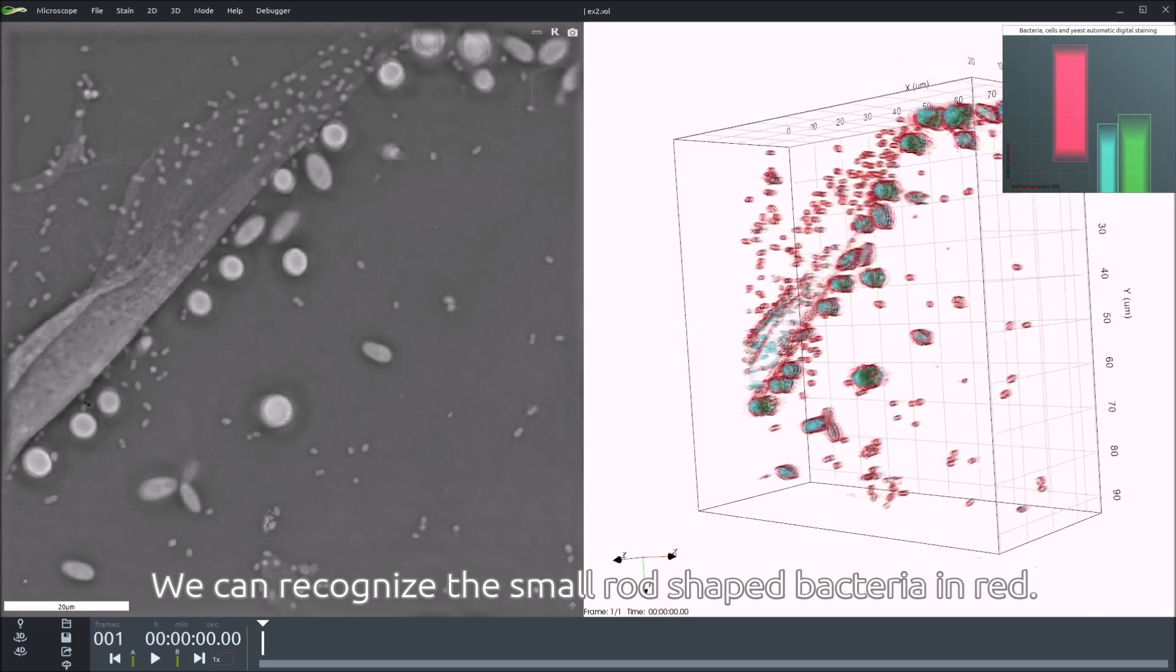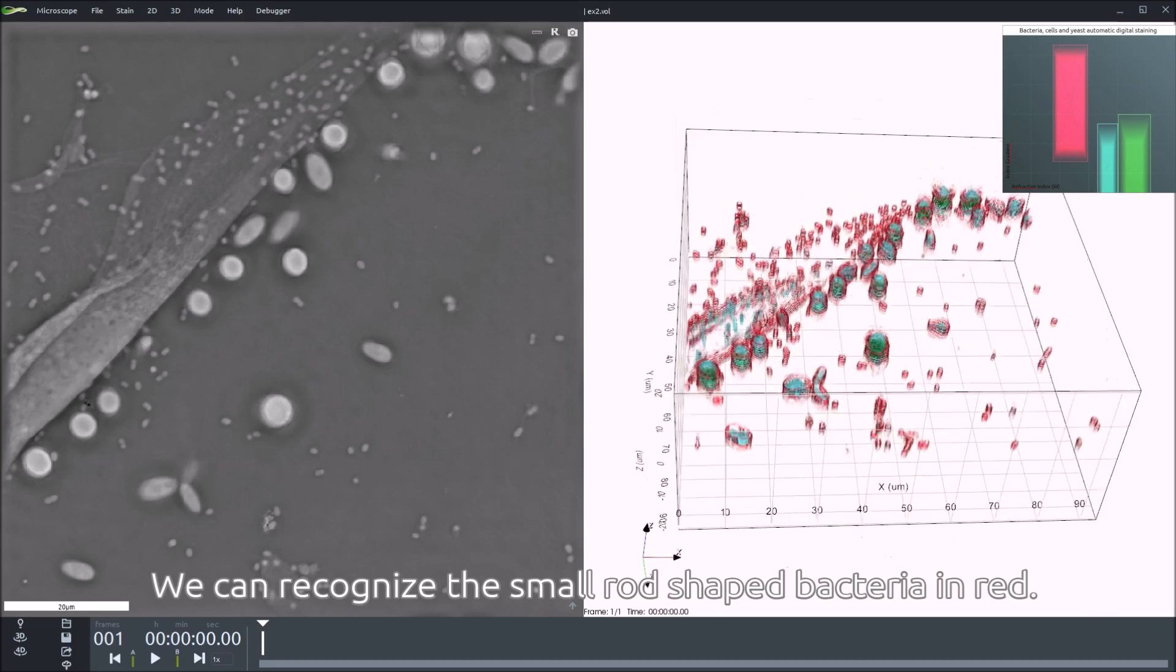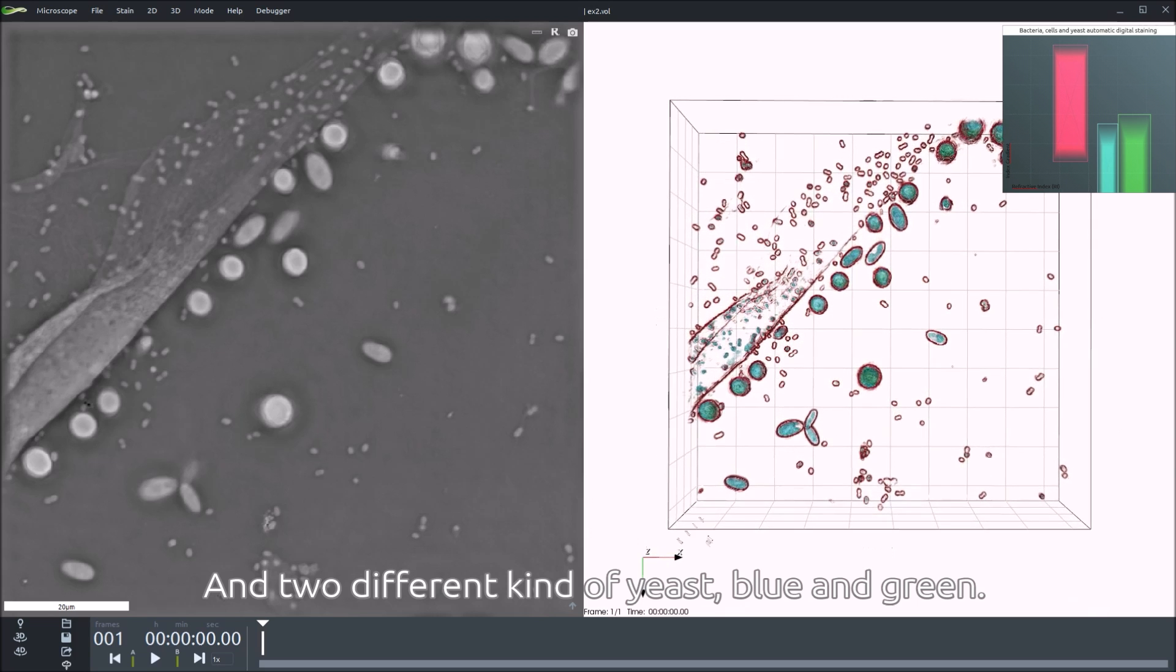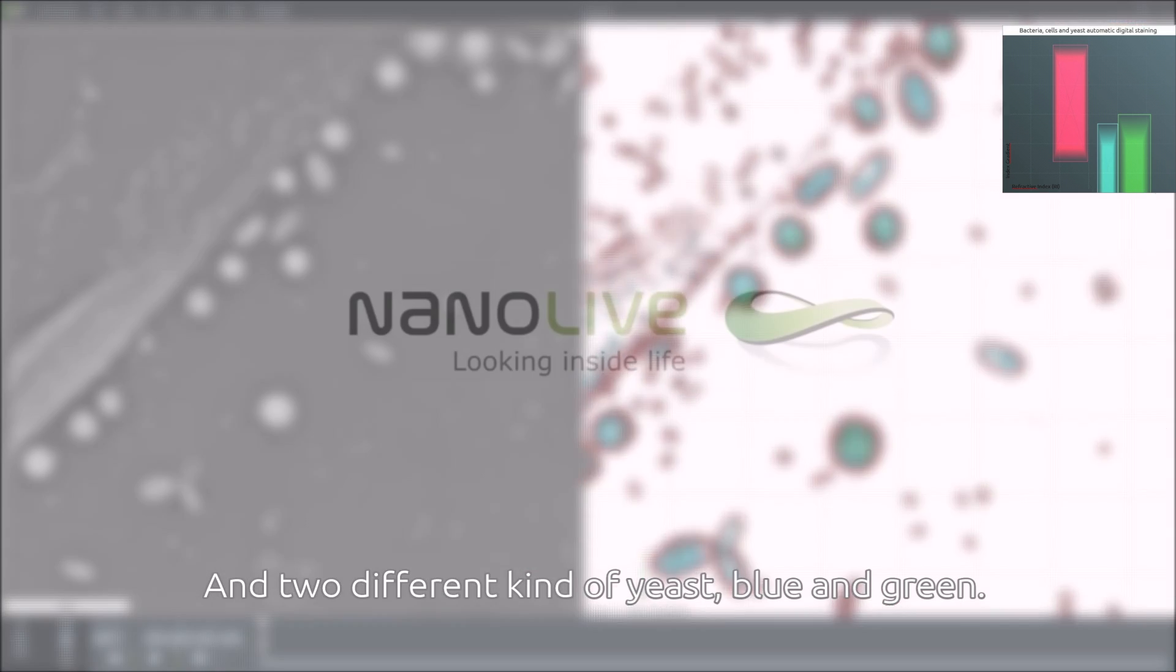We can recognize the small, rod-shaped bacteria in red, and two different kinds of yeast, blue and green.